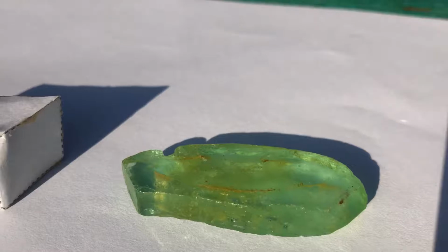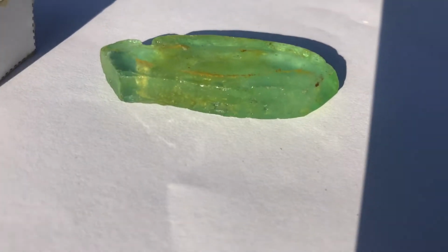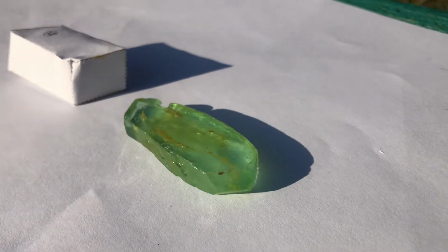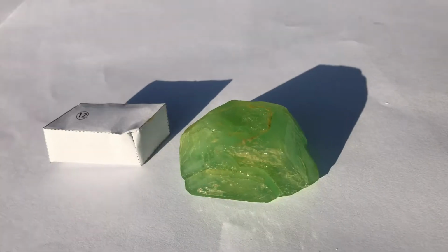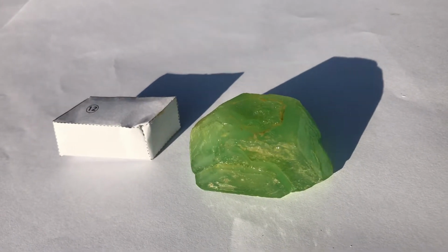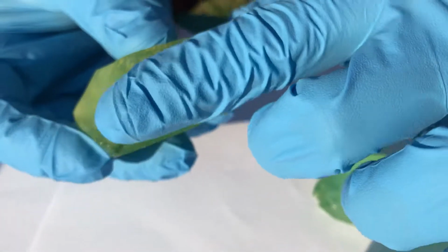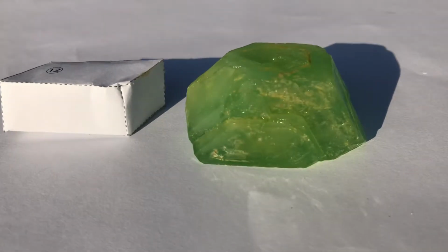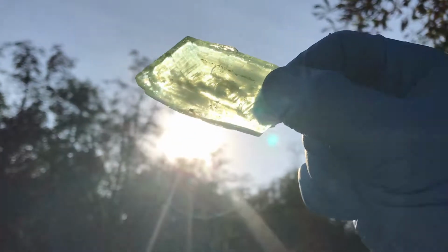However, I have achieved a modification of its shape by not letting the crystal a physical space where it can grow. It grew near a wall of the container, so that I forced the crystal to evolve in a condition of pressure. The other one had grown into a container that wasn't stored properly. Some of the iron 2 sulfate has turned into iron 3 sulfate with a completely different crystal lattice, so in the solution were 3 different substances.